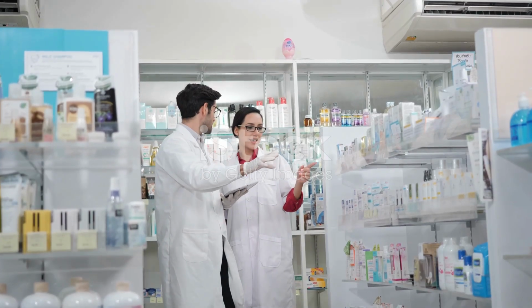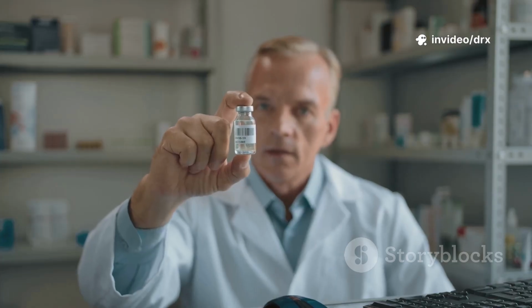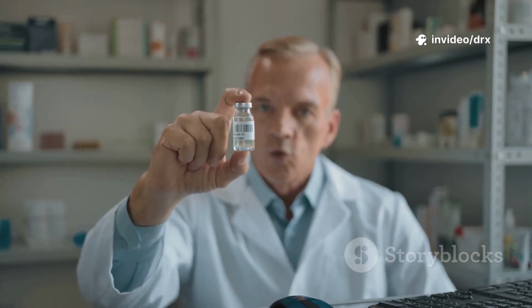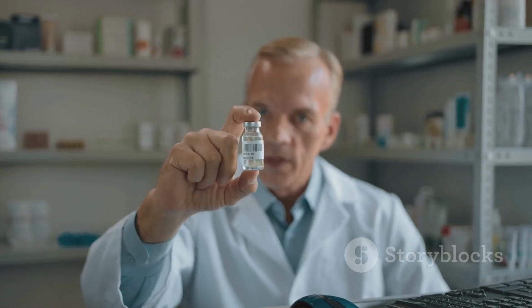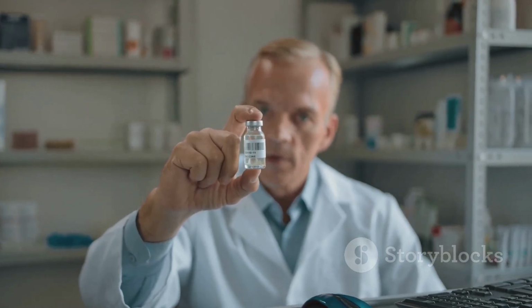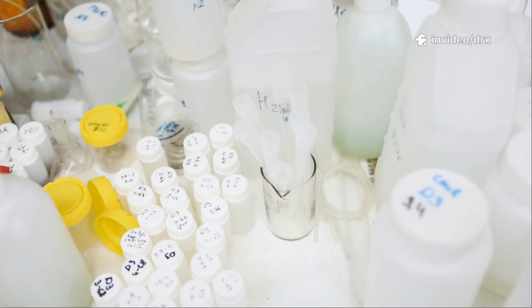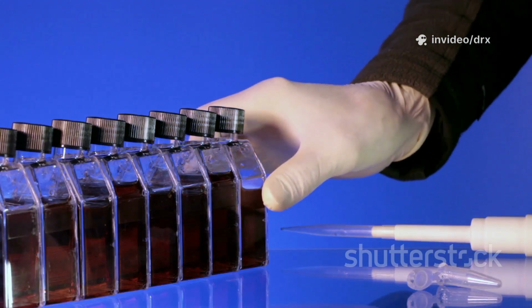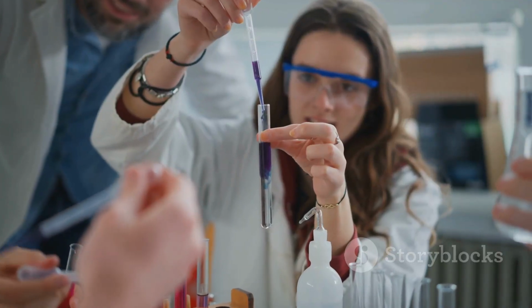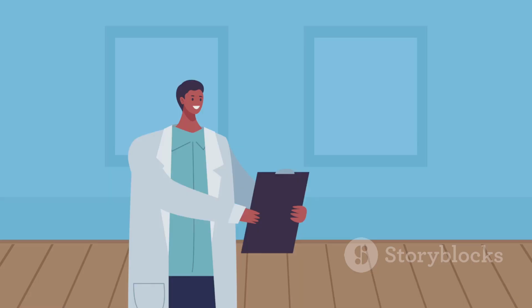Now, let's talk about where this is actually used in pharmacy. This method is commonly used for the assay of weakly basic drugs, such as ephedrine, antihistamines, diphenhydramine, chlorpheniramine, atropine, and aminopyrine. It's also useful for weak acidic drugs, including benzoic acid, salicylic acid, and phenol. So, as you can see, it has quite a few important applications in pharmaceutical analysis.